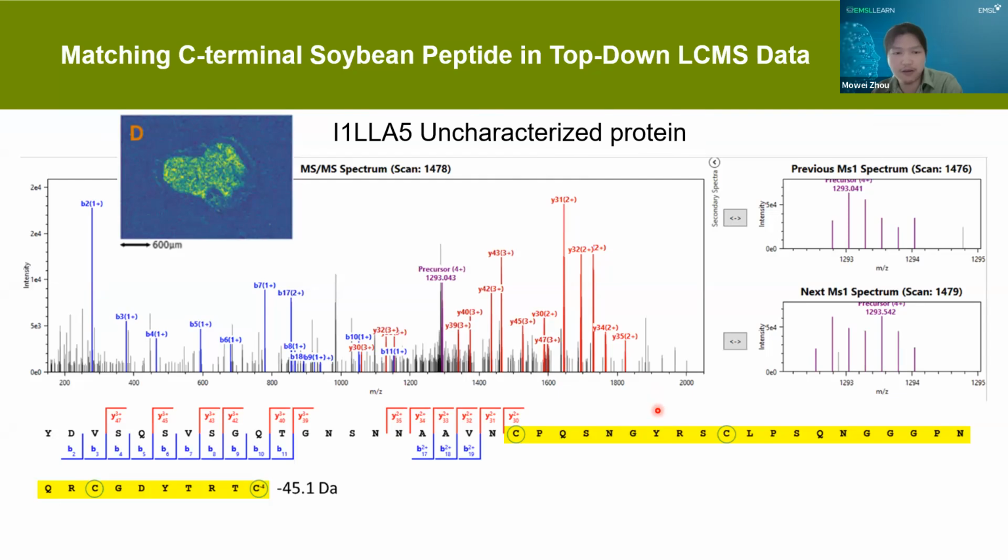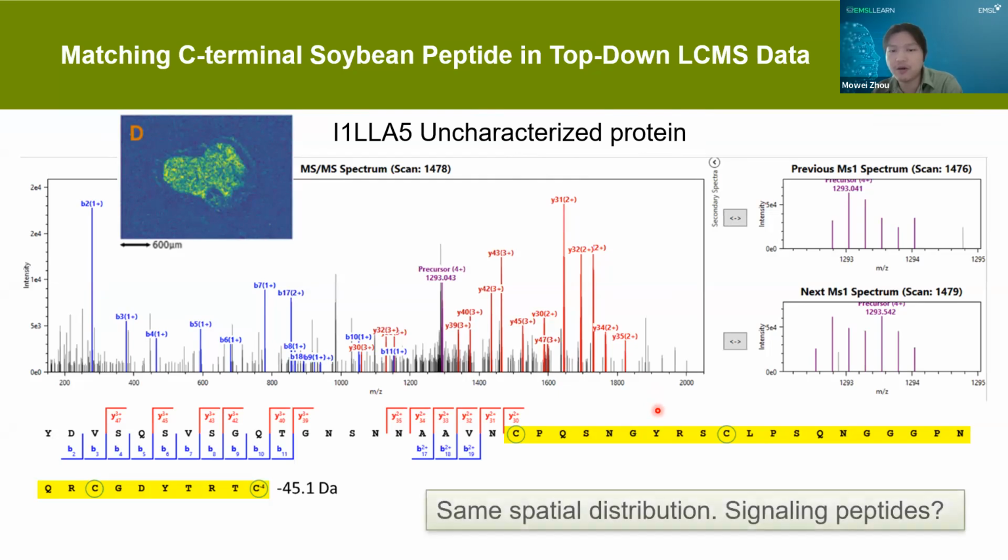This is actually not that irrelevant biologically, because there are some known secreted peptides. Many of them are also known to have disulfide bonding to stabilize the structure. Those tend to be signaling molecules for recognition. So we think maybe those are not just random degraded proteoforms from artifacts, but maybe some of them are specific to some signaling pathways. And this is just a very broad hypothesis.